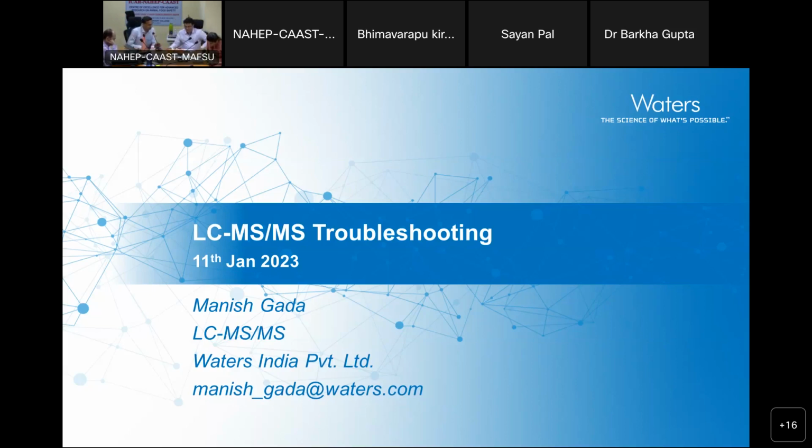First of all, thank you very much for giving me the opportunity to speak to this huge audience, participants who are probably more knowledgeable than me in this field. I'll be talking in general about troubleshooting for LCMS equipment.